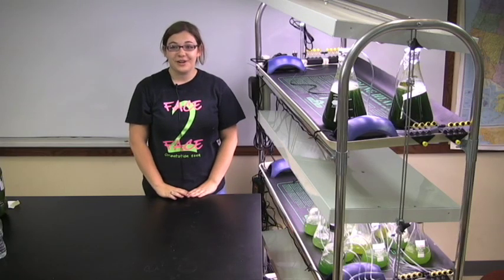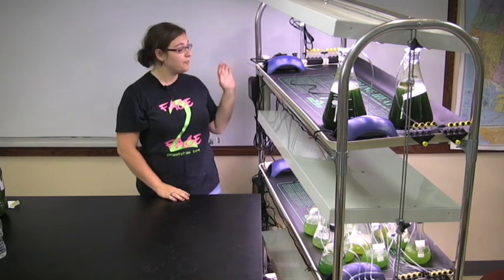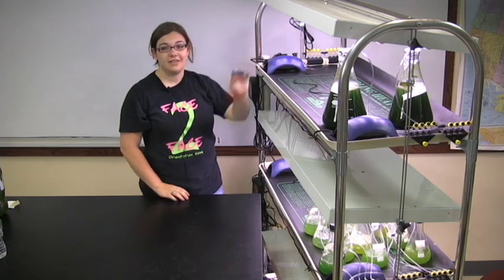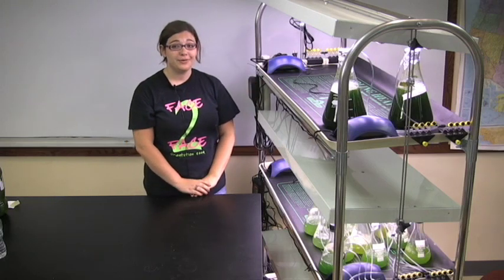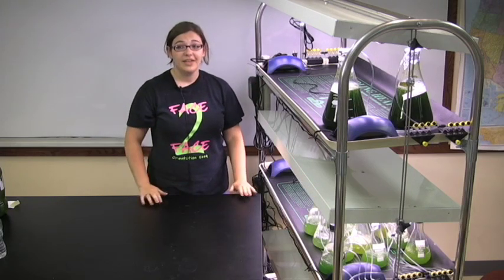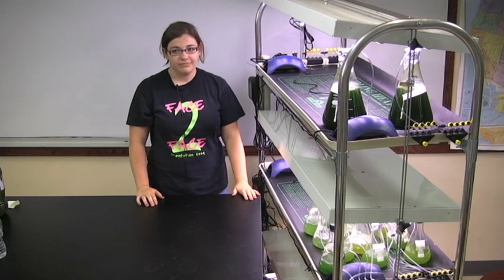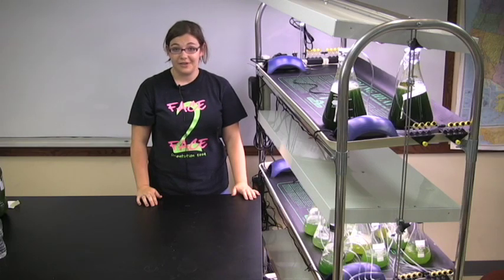All of our algae cultures are grown on commercially available heat mats, controlled by a thermostat using a temperature probe taped to the middle of the heat pad. The thermostats are set to specific temperatures found through research to give optimal growth. In a classroom setup, a heat mat is not required — we have successfully grown cultures without them. If you are growing algae on a window sill, be mindful of sunlight and outside temperatures, since both can affect the temperature of your algae.